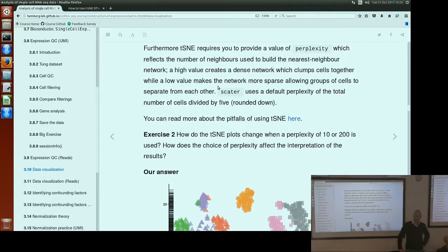And so t-SNE tries to do this in various ways, and one of the trade-offs is that it's going to sort of zoom in on elements of the structure and display them in parts of the 2-dimensional map, so that we can't interpret distances in the top left corner in the same way as distances in the bottom right corner or vice versa. So it's just the visual inspection of your data, nothing else, I would say.